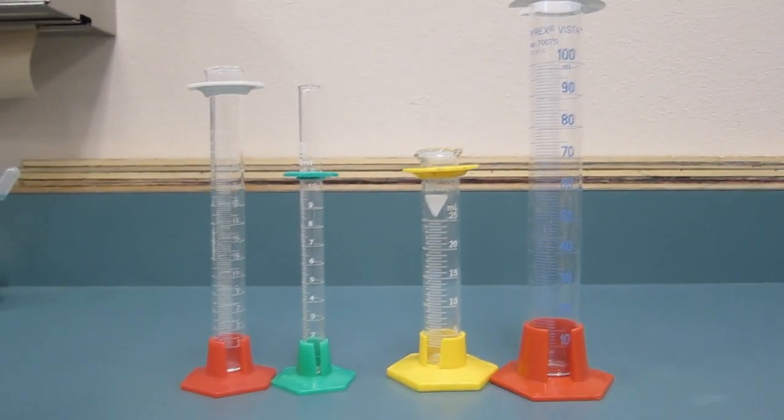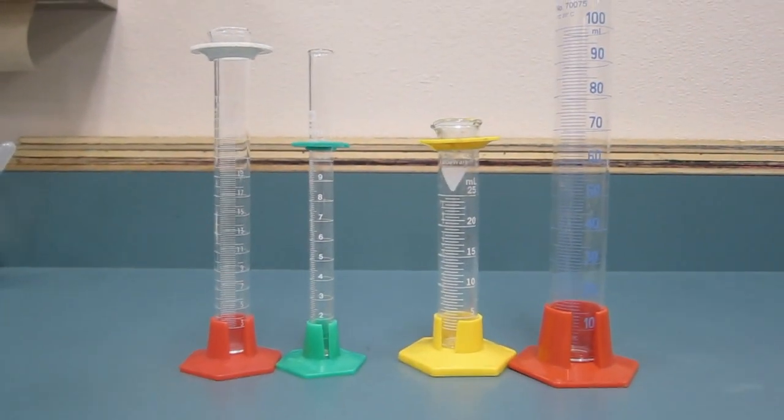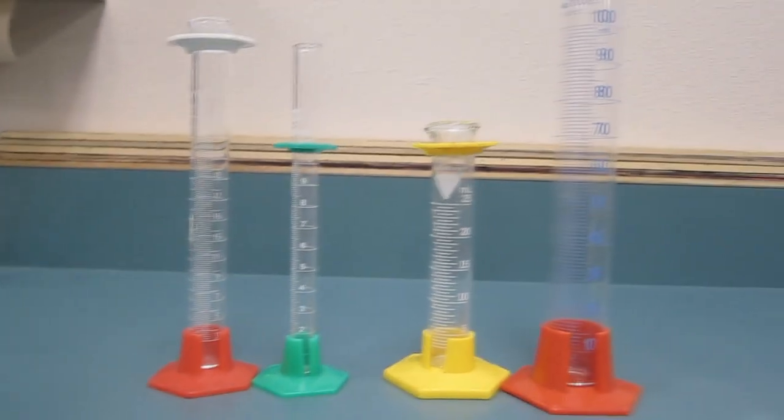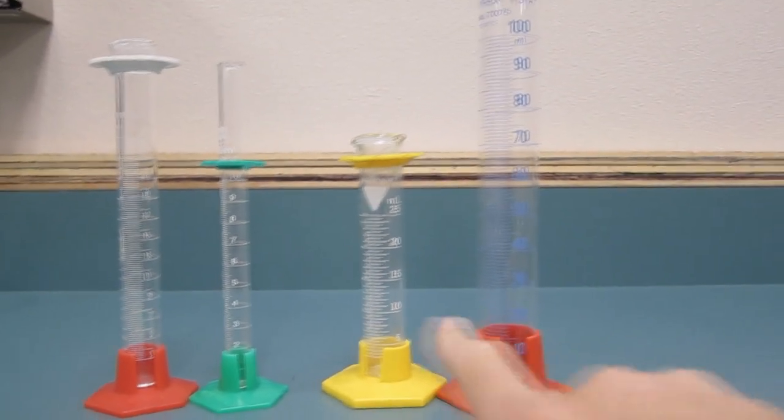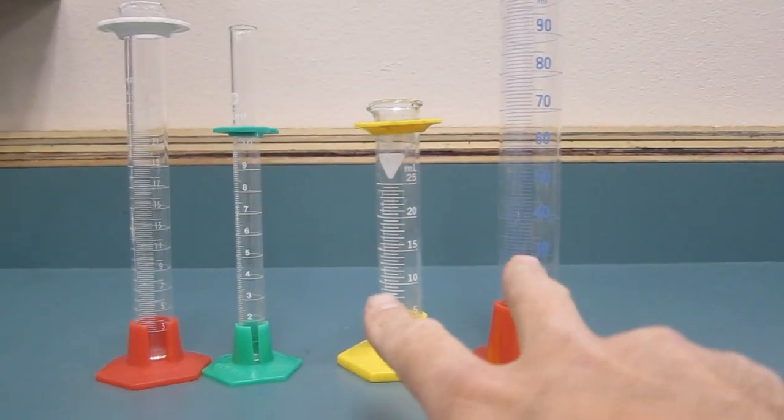We have several different graduated cylinders you'll use to measure volume in here this year. We have the 100 milliliter one and the 25 milliliter ones. These are probably the two most common.